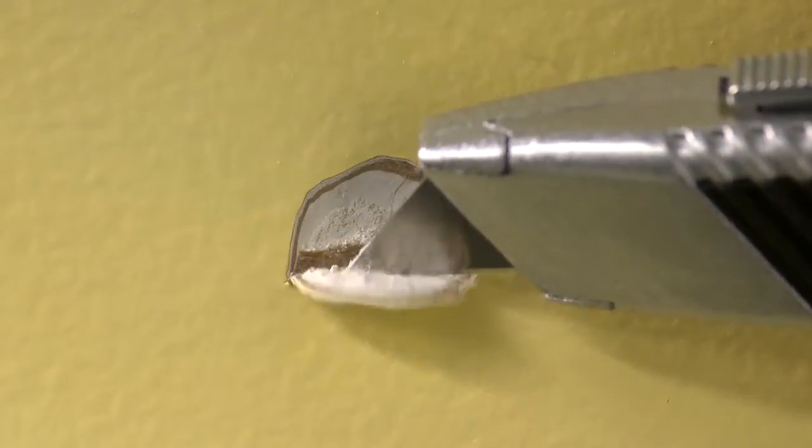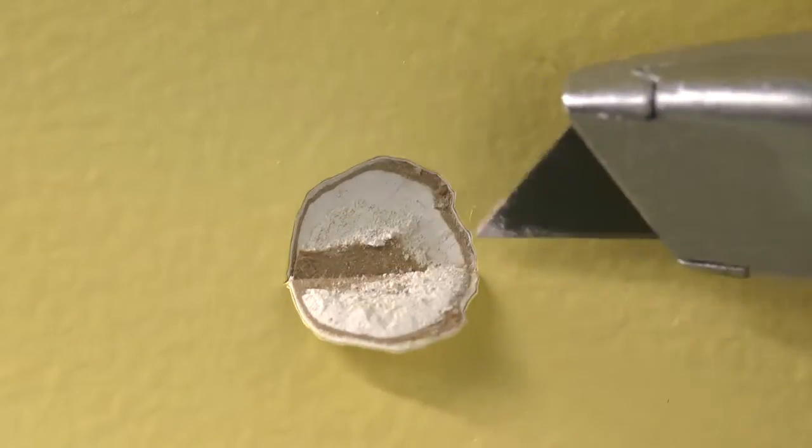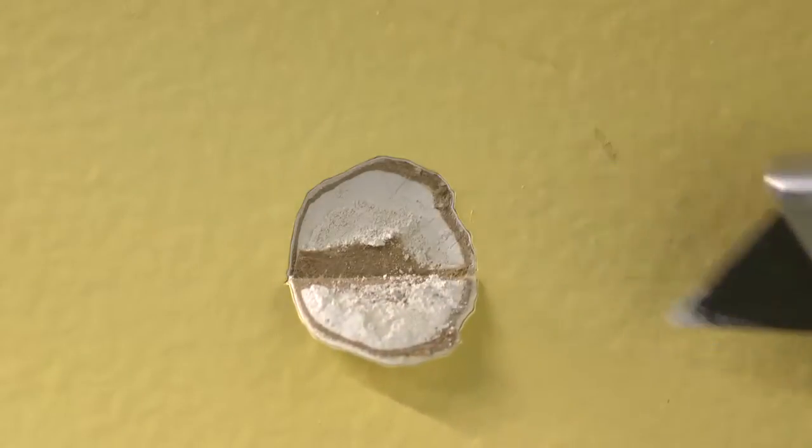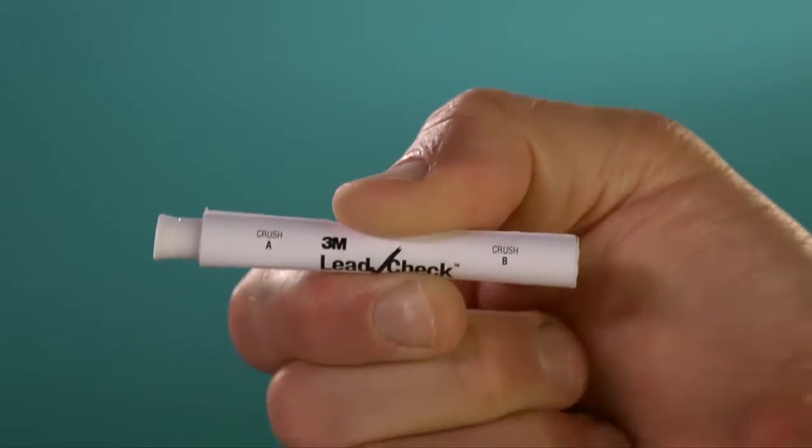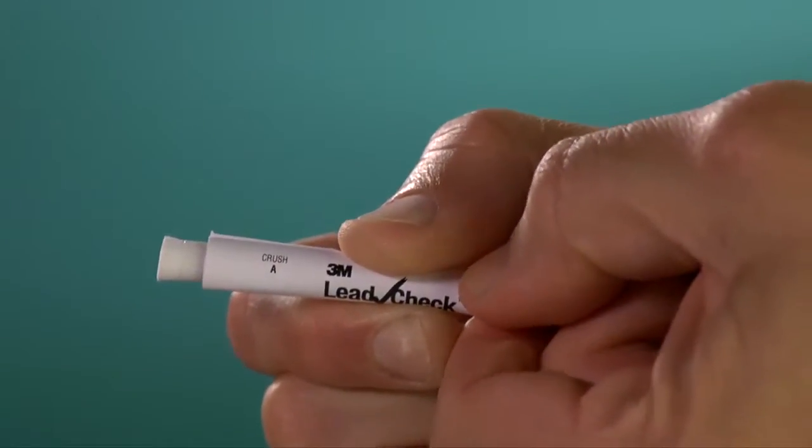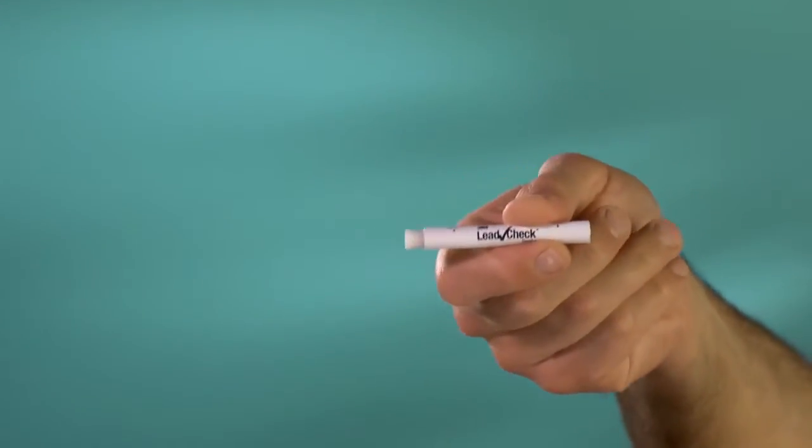Once you have cut through all of the paint layers, use the blade of the knife to fold down the semi-circular flap so that it forms a pocket. Prepare and activate the LeadCheck test swab exactly as described for wood surface testing. Then, test the drywall or plaster area.